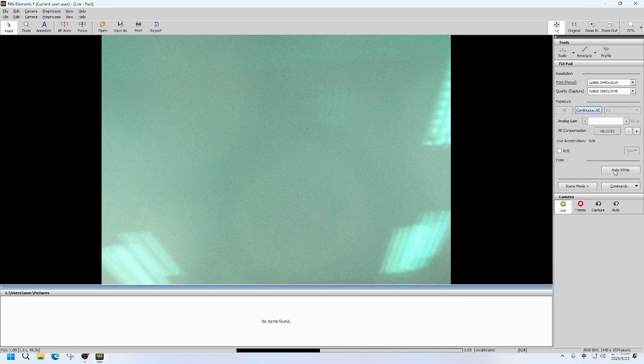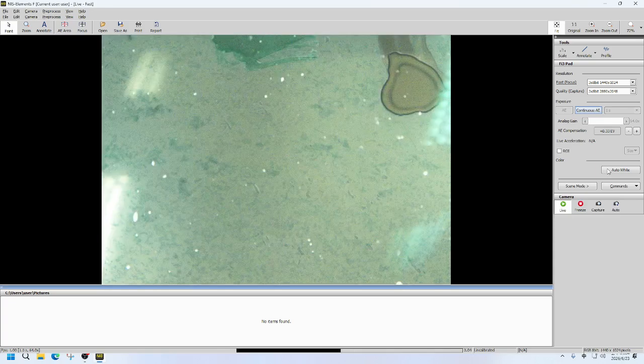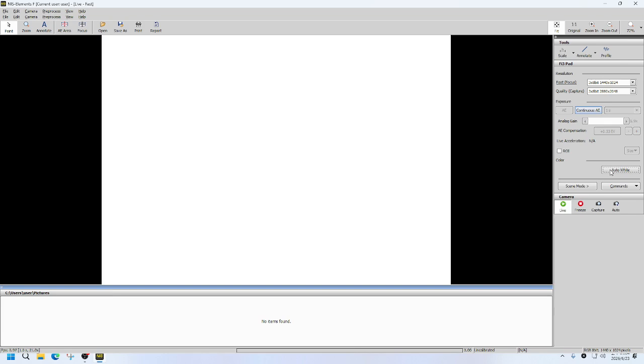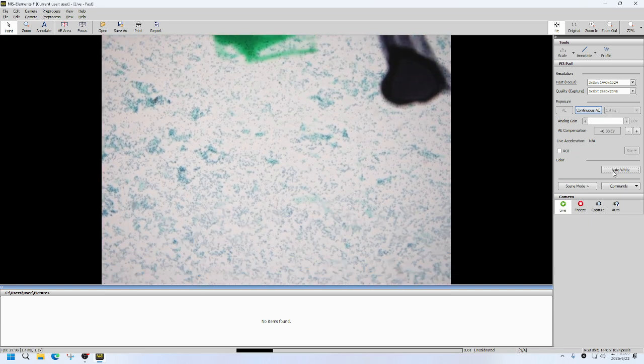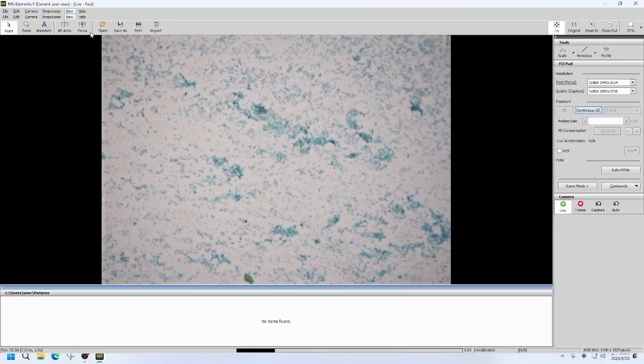So the first patient is a 61-year-old male. This is an ascites specimen. For the ascites specimen, when we interpret it, the first thing we need to check is the gender of the patient.